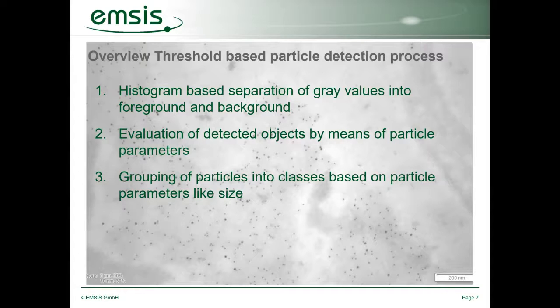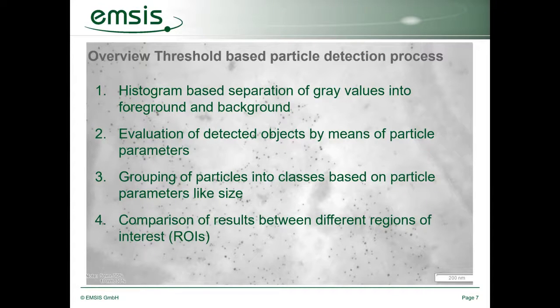It's a kind of preparing the results, and these results can be grouped into classes based on one of the particle parameters chosen before, like the size. And if you like to, that's an additional option. You can compare the results you have obtained even between different regions of interest on your image or between different images.